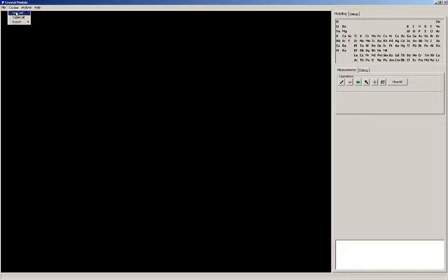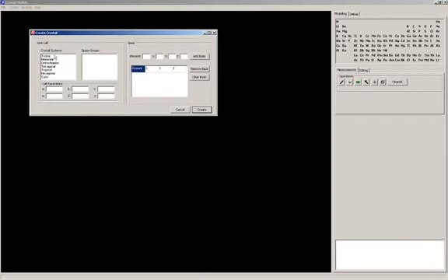So under crystal here we click on unit cell, and in the list of crystal systems we pick cubic, and in the list of space groups we go for Im-3m. We're gonna add 2 tungsten atoms, one at the origin of the root space, and then another one at point 5, point 5, point 5.